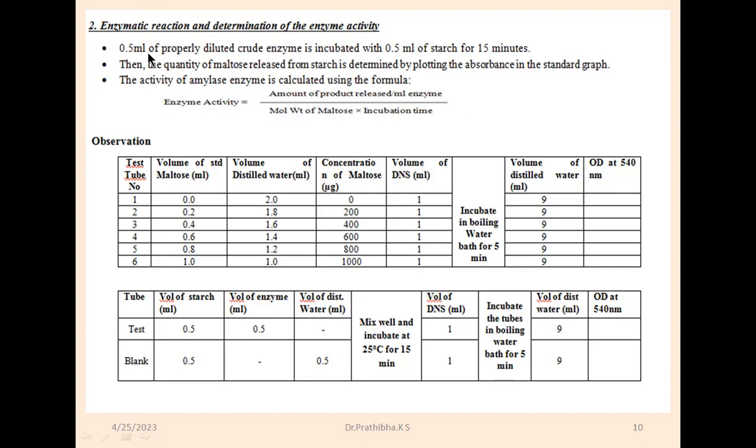Okay. So here you need to take 0.5 ml of properly diluted crude enzyme. Then incubate it with 0.5 ml of starch for 15 minutes. Then you need to apply the activity calculation and find out how much activity has been done. So this is the observation.